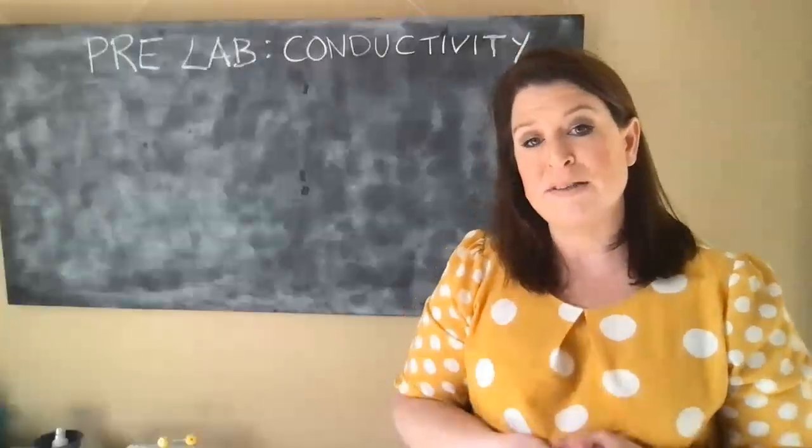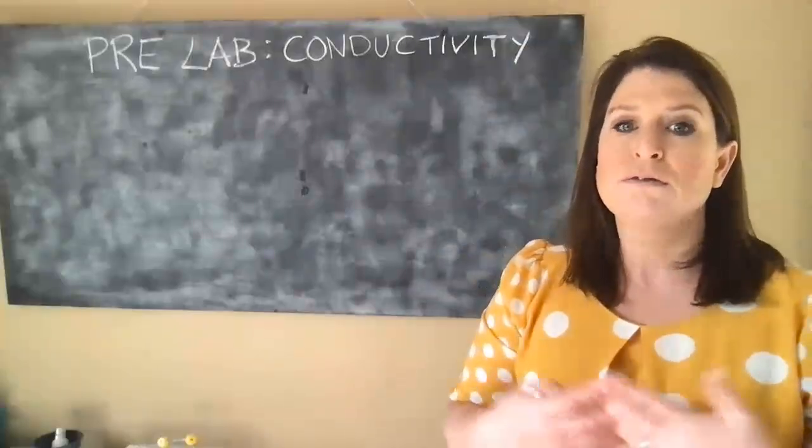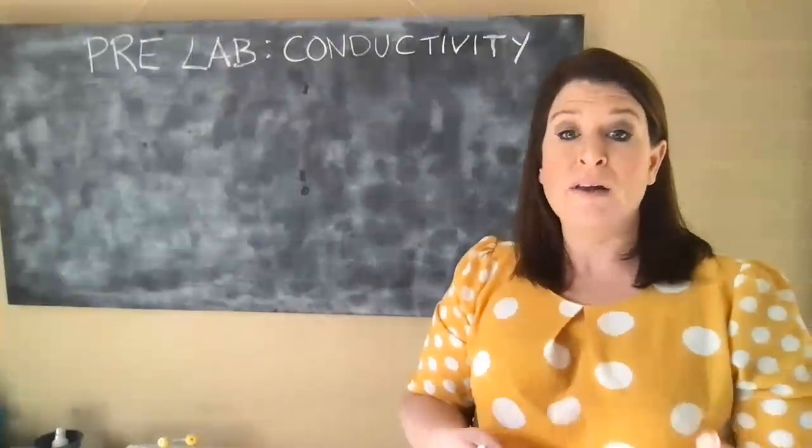Then in the second part of the experiment, we're going to use conductivity as an analytical tool to analyze solutions.